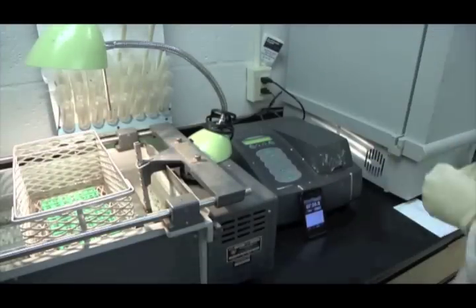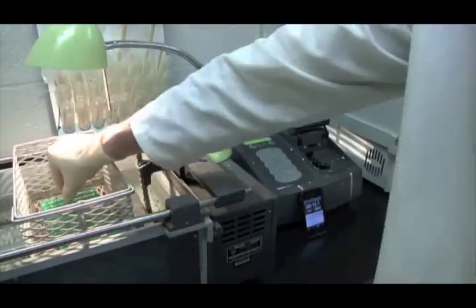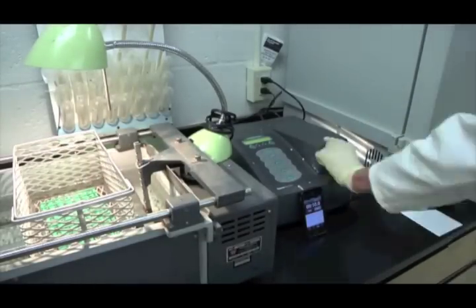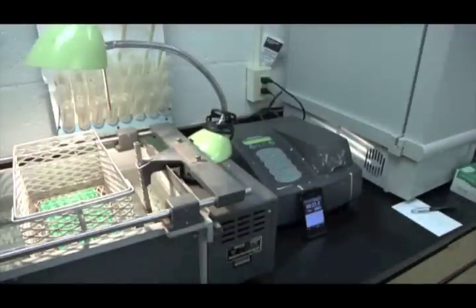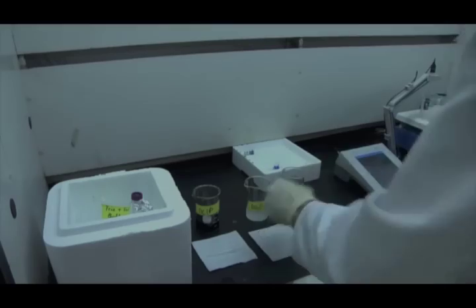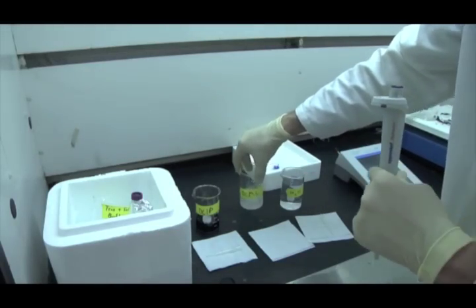A similar solution to the control was prepared with the exception of wrapping the cuvette with aluminum foil. Absorbance of the prepared solution was measured immediately, then placed in the water bath under photosynthetic light. The cuvette was removed and absorbance measured at 1-minute intervals for 10 minutes, and absorbance value recorded. The spectrometer was re-zeroed after every 5 readings.